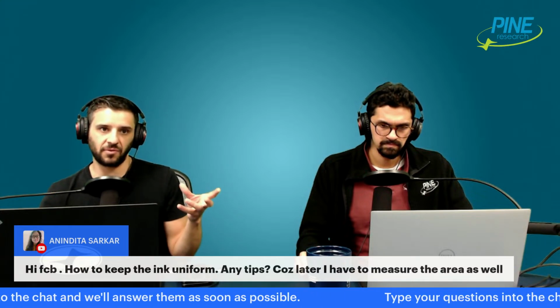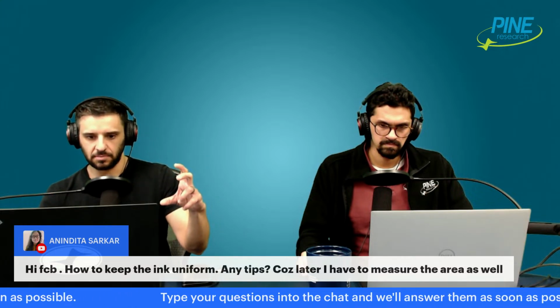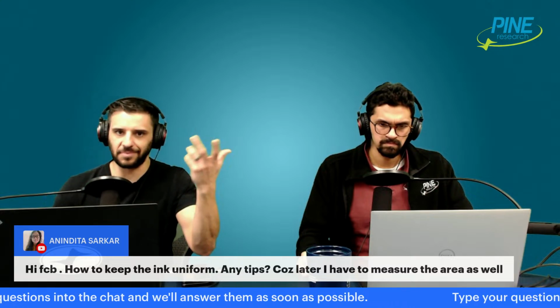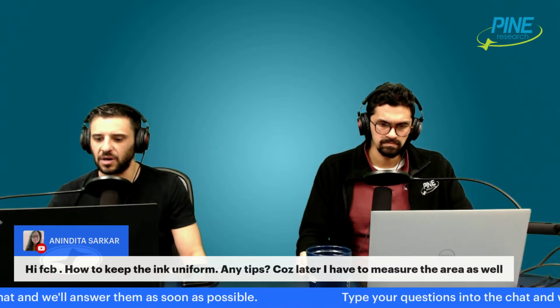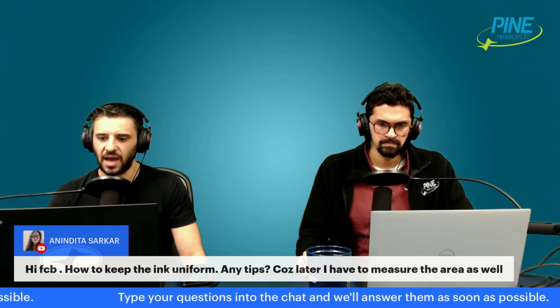Just again, be careful as well when you handle it, because with your gloves, you could break the carbon, or your gloves will smudge some of the ink. So there's just some things to be aware of. Some of this is like an arts and crafts project. So you might need to have some trial and error, let's just say, as you figure this out.